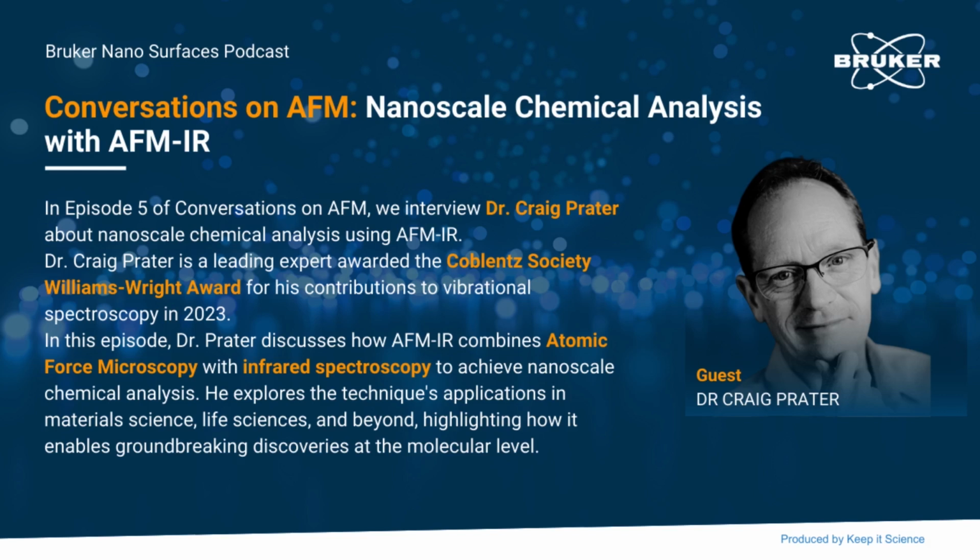So, for example, if you were to use a microscope using visible wavelengths, you'd be able to get a pretty sharp image with spatial resolution down to a few hundred nanometers. But if you replace that visible light with infrared light and try to do the same measurement, the image becomes blurry because the infrared wavelengths are an order of magnitude longer than the visible wavelengths. So instead of having spatial resolution of a few hundred nanometers, you have spatial resolution of several to many to a few tens of microns. And so, that's very, very coarse compared to the spatial resolution of an AFM.